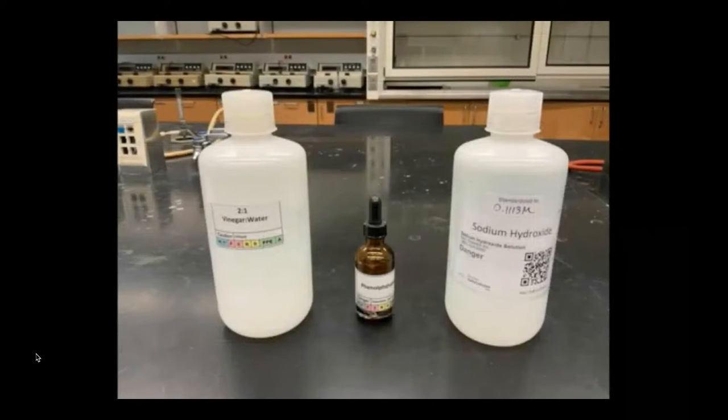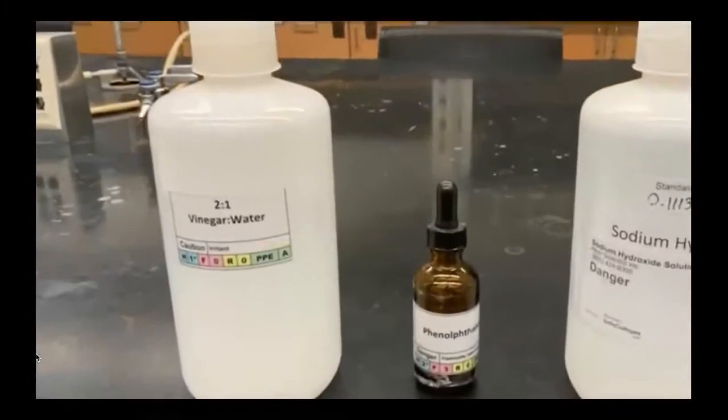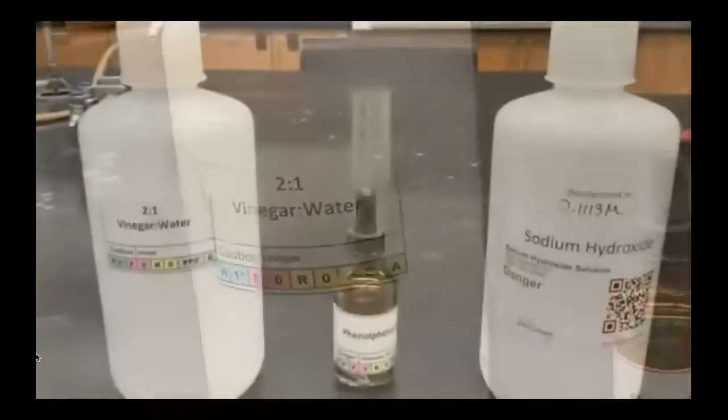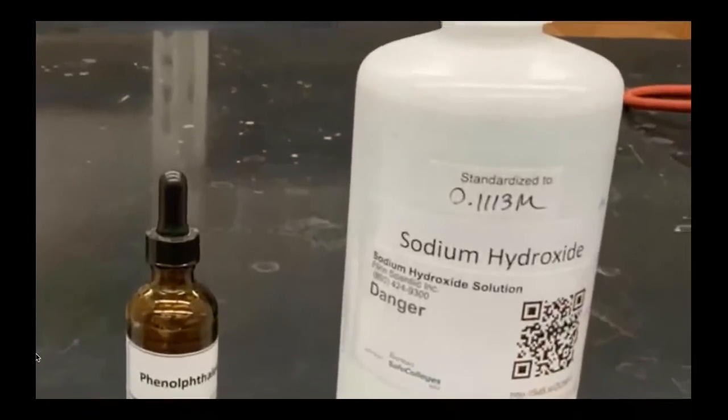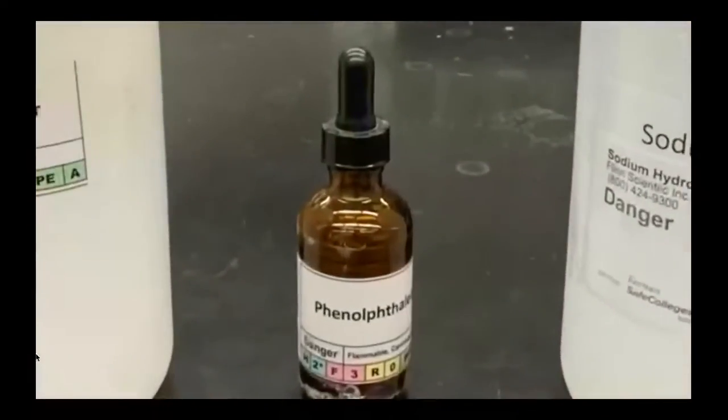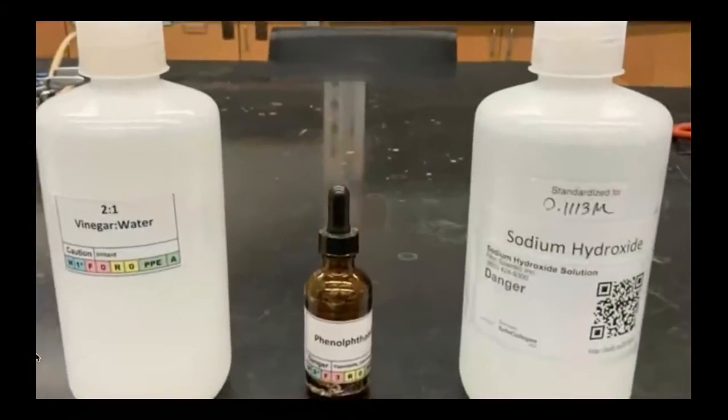In this titration lab, we'll start by gathering our necessary materials. We have vinegar, which we are trying to find the amount of acid in. We have our standard, sodium hydroxide, and our indicator, phenolphthalein.